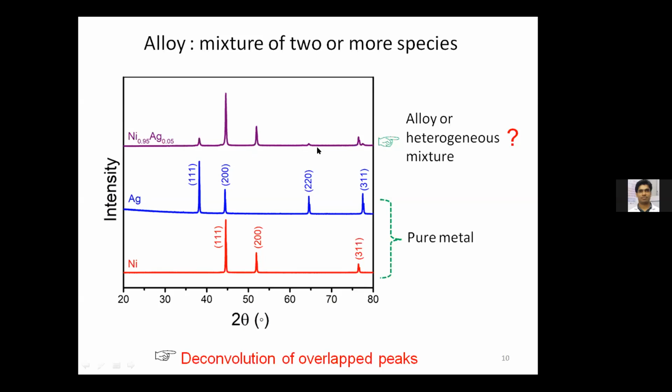So we were confused. This is a particular example where Rietveld analysis can add a huge amount. Rietveld refinement was first started by Hugo Rietveld basically because of overlapping peaks, to isolate or deconvolute them.